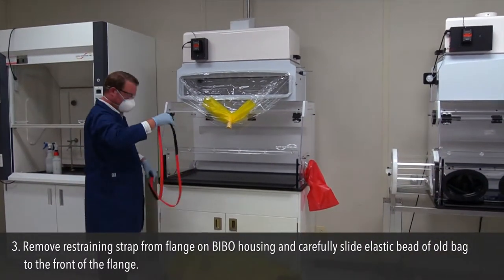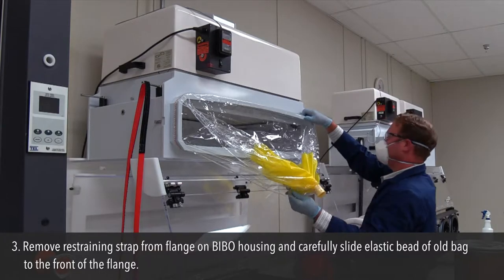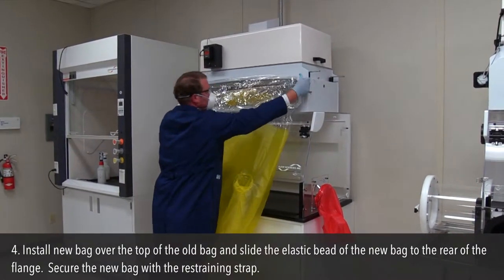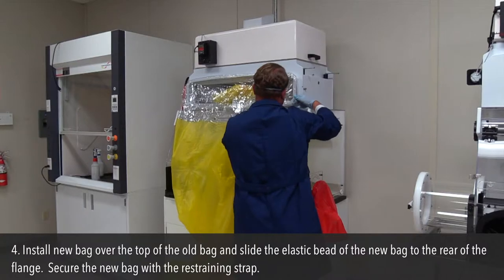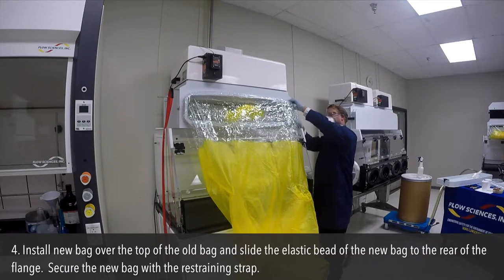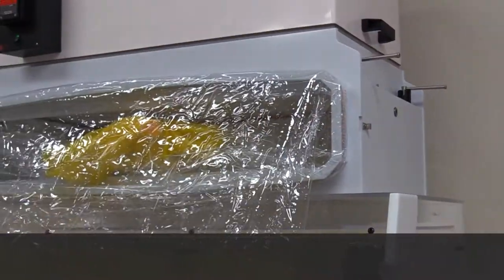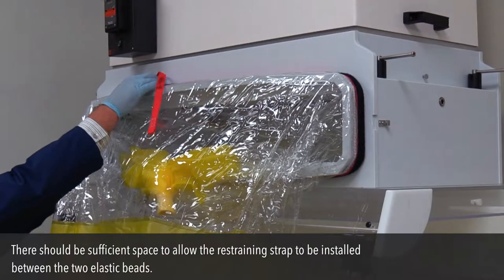Step 3: Remove the restraining strap from the flange on the BIBO housing and carefully slide the elastic bead of the old bag to the front of the flange. Step 4: Install the new bag over the top of the old bag and slide the elastic bead of the new bag to the rear of the flange. Secure the new bag with the restraining strap. There should be sufficient space to allow the restraining strap to be installed between the two elastic beads.